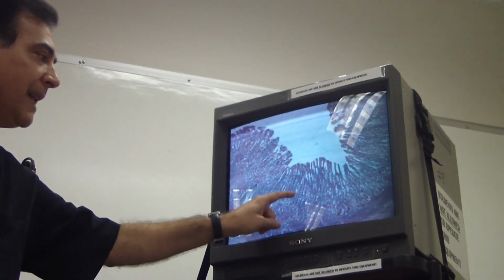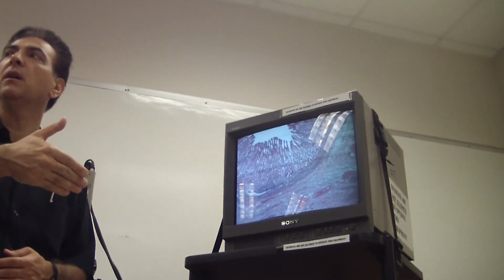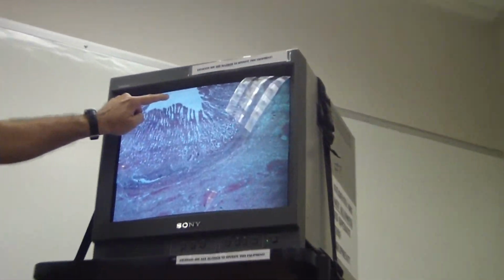Right in between you have lamina propria. Can you all see this little kind of, I guess, dark pink right here? See that? See right here? Right below the epithelium, or right below those gastric pits? That's the muscularis what? Mucosa. Muscularis what? Mucosa. So what is mucosa made of? Epithelium, lamina propria, and what? Muscularis what? Mucosa. So that's the lumen.